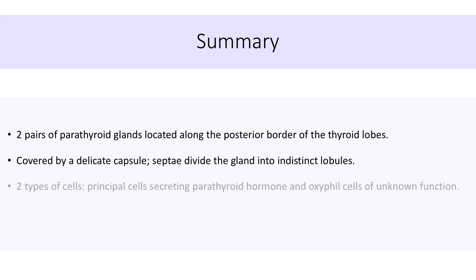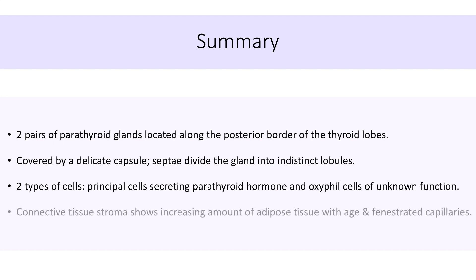Two types of cells are found in parathyroid gland: principal cells, which secrete parathyroid hormone, and oxyphil cells of unknown function. Connective tissue stroma shows increasing amounts of adipose tissue with age, as well as fenestrated capillaries.